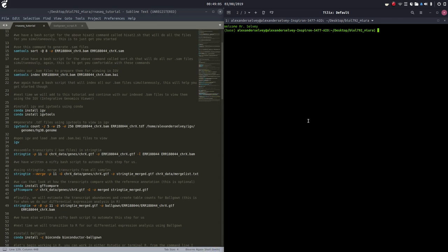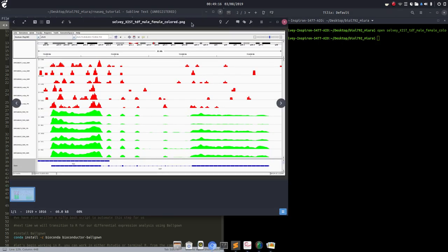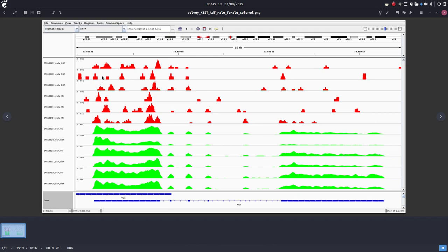Last time I didn't get the opportunity to show you this, but we will open this up right now. This is a picture visualizing in IGV the male and female chromosome X — this should say XIST, that gene — so we can see that in males and females we have some differential expression. Today we're going to look at that in ballgown, make a little plot, and show you. Here are all the male samples, female samples, and we can see some differential expression patterns here.